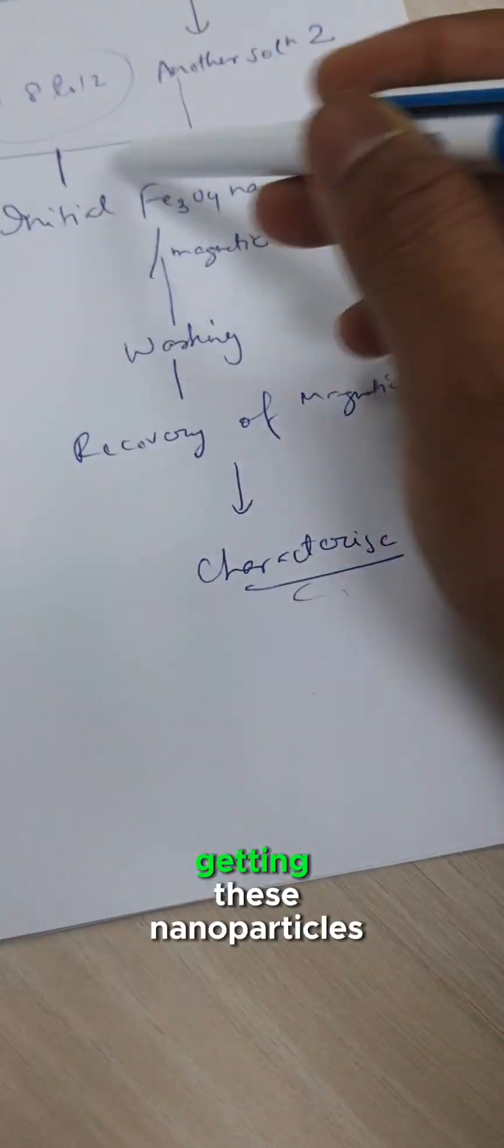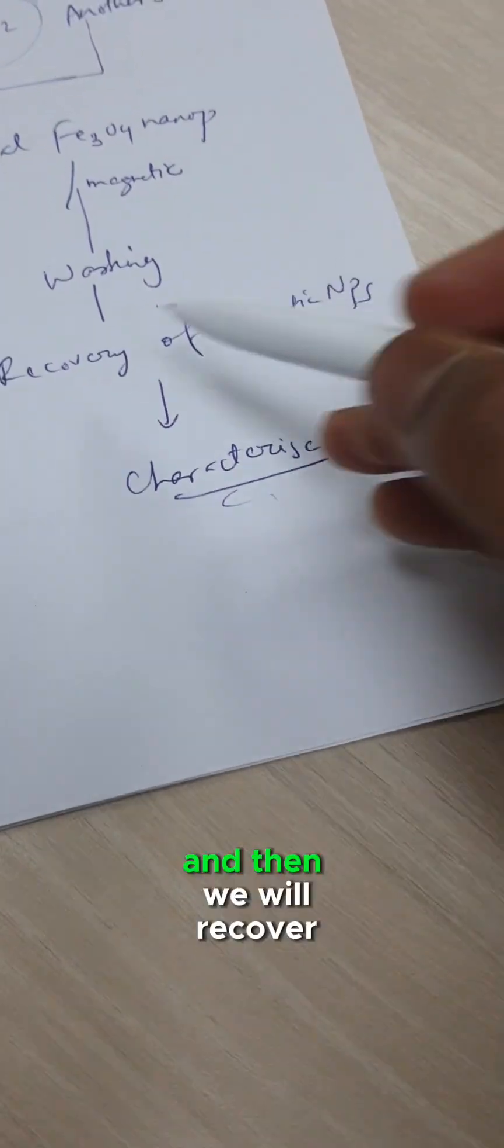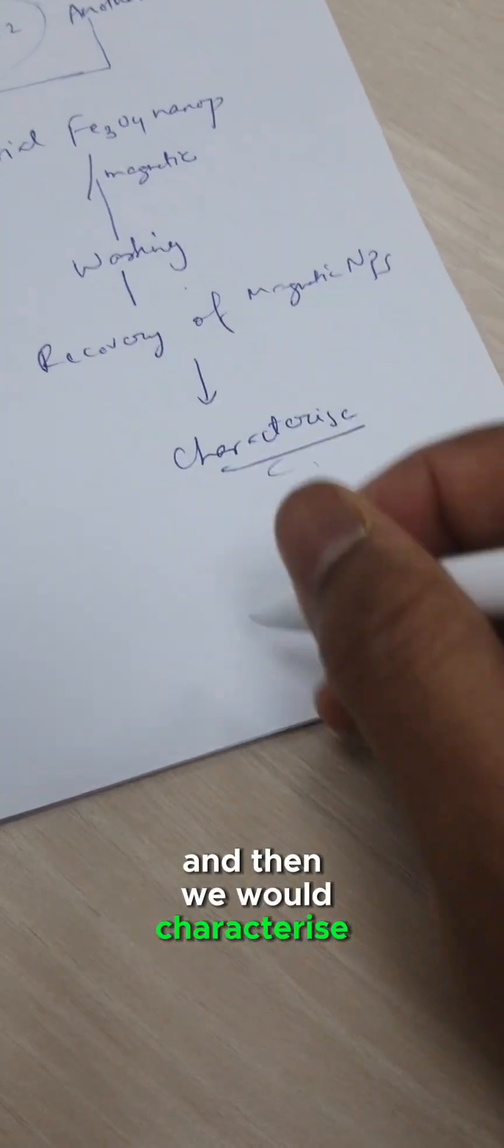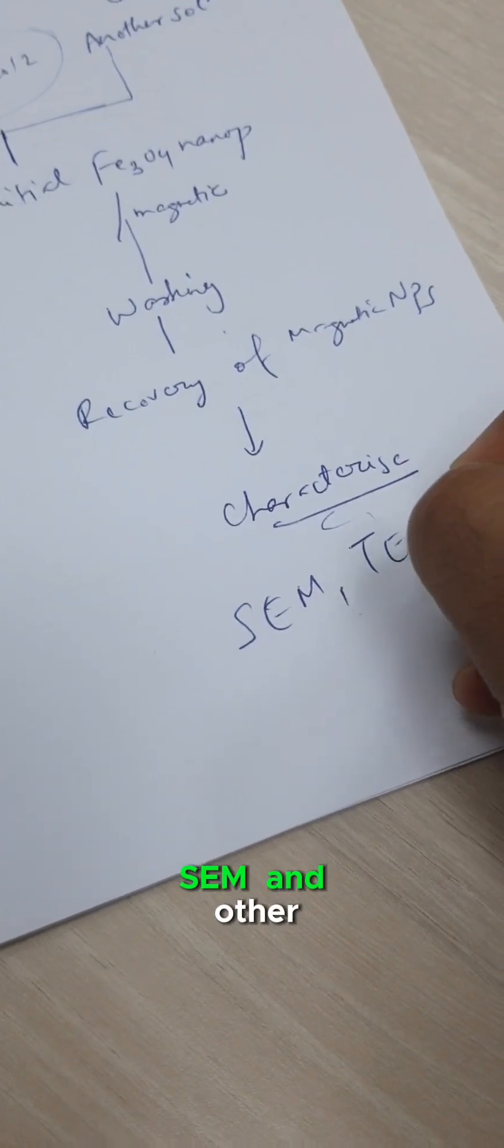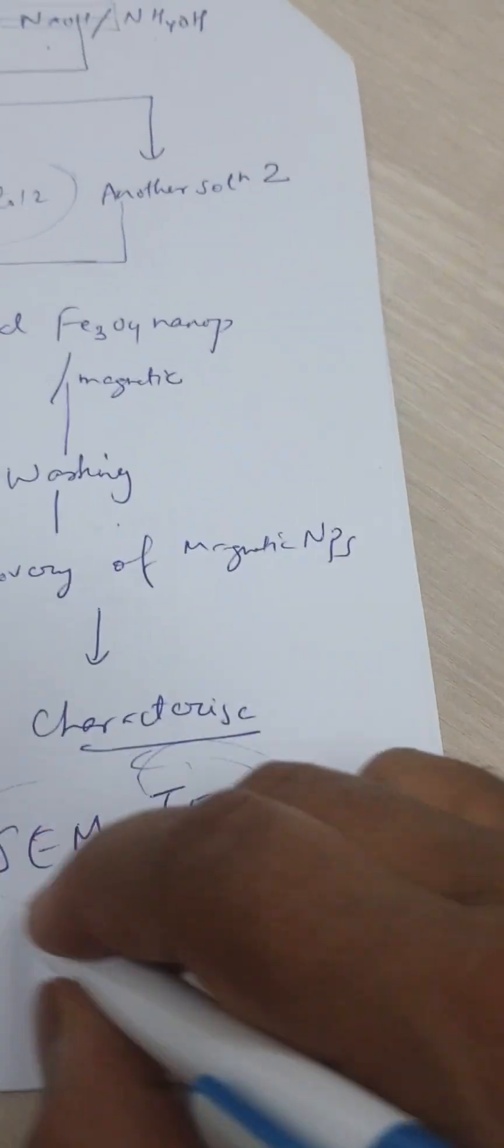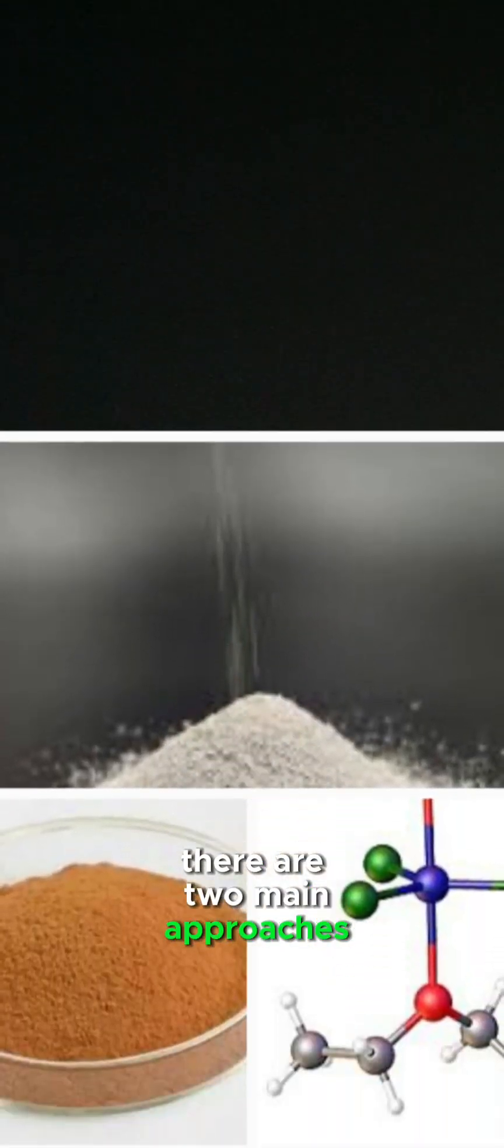Then we'll get nanoparticles which will be magnetic, and then we'll wash them, recover them, and characterize them using techniques like XRD and other characterization techniques.